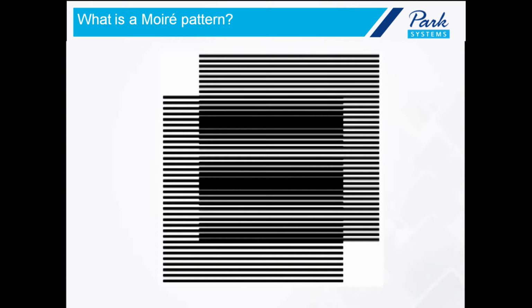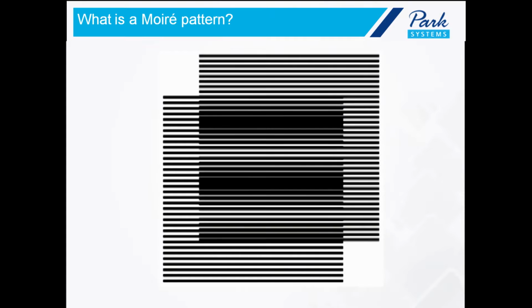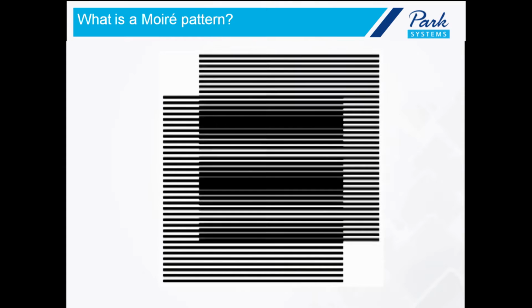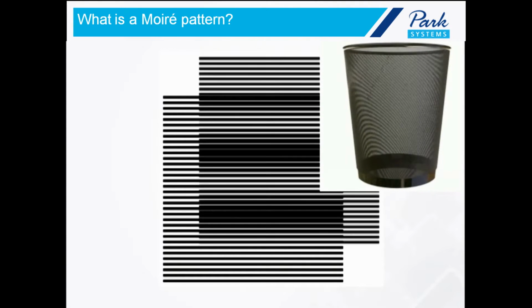And as the graphene is offset by rotation on top of the HBN, it produces, again, a visually evident pattern, a Moiré fringe, where those two layers overlap. So here are some other examples of where you'll see Moiré patterns.